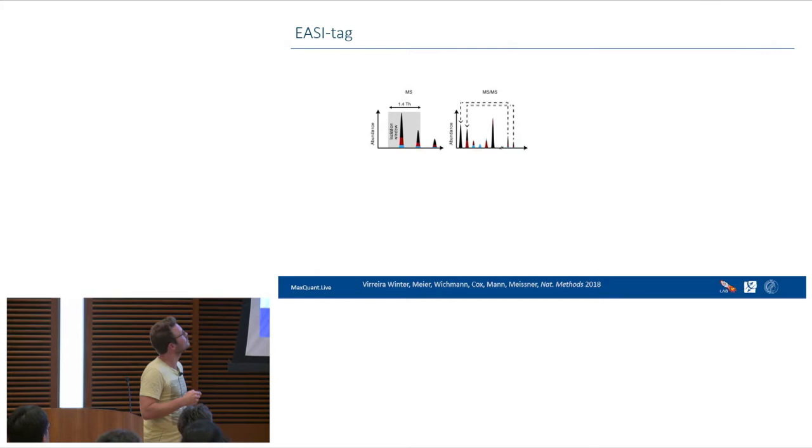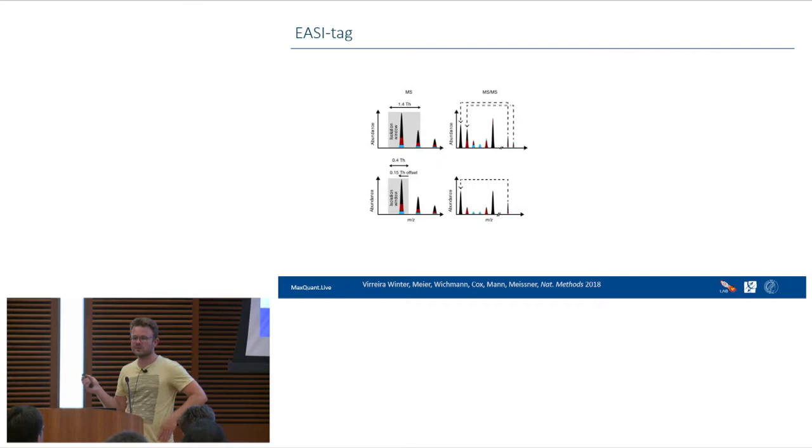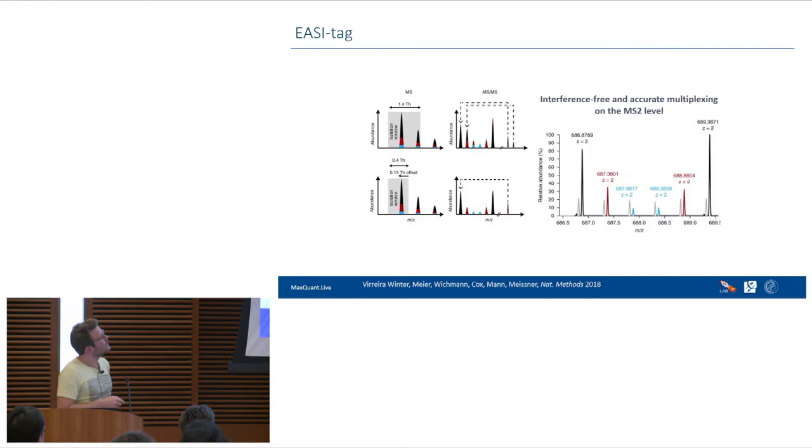But there is some problems when you apply normal top N strategy to that. Because normally the mono isotopic peak is selected for fragmentation. But it can also happen or it often happens that it's the first peak or the second. But let's assume it's a mono isotopic peak. Then there is the isolation window which is usually like 1.4 Thompson. And then also part of this first isotopic peak is in this window. And the whole strategy doesn't work anymore. Because we have this one isotope which should be used for the quantification. But it's contamination in this case.